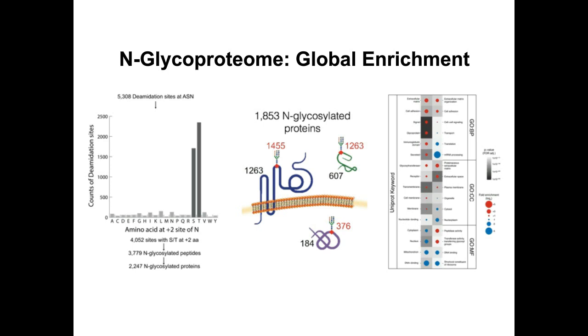And if one takes a careful look, our glycoproteome is heavily enriched in cell surface, extracellular membrane, extracellular matrix type ontology annotation terms, but is depleted in nuclear or intracellular terms, as one would expect for an enrichment of N-glycoproteins.